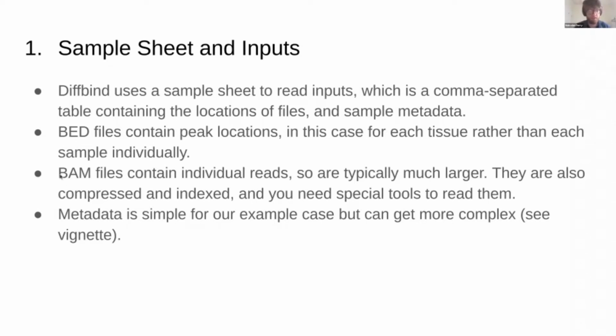We also still need the BAM files. We don't just go from the annotation of the peaks for this. We actually do need to find out exactly how many reads are bound there. As we'll see, the regions of the peaks might change slightly as well. I don't know how familiar people are with BAM files. They can be a little bit tricky because they're compressed files, so you can't read them directly.